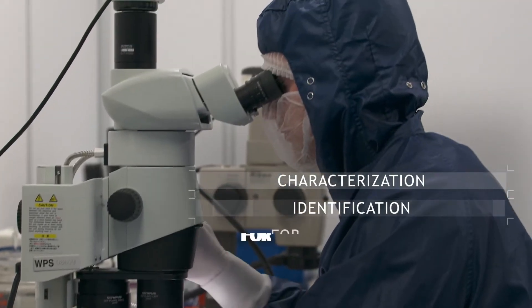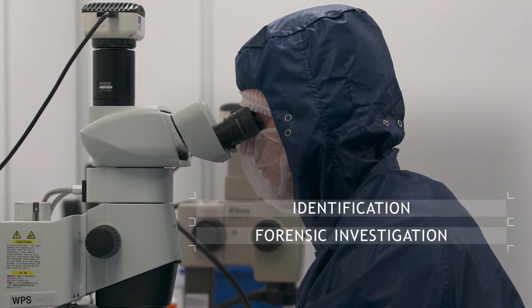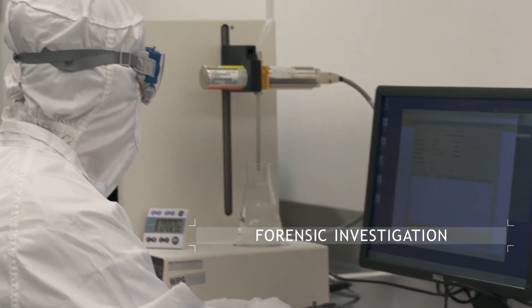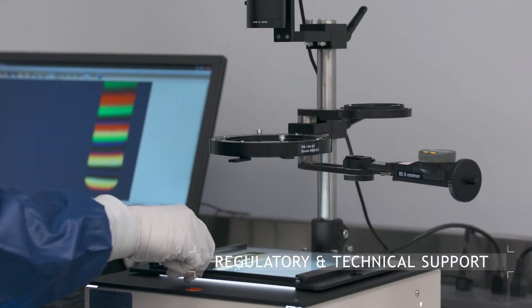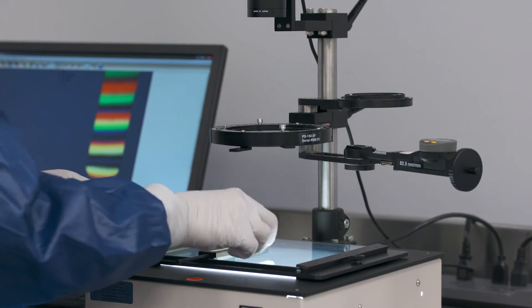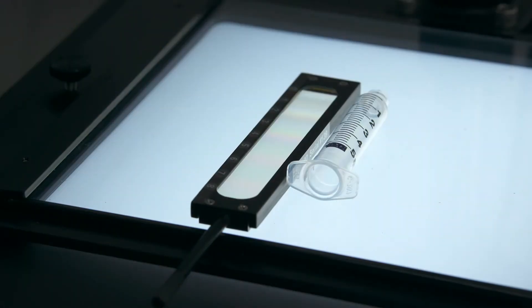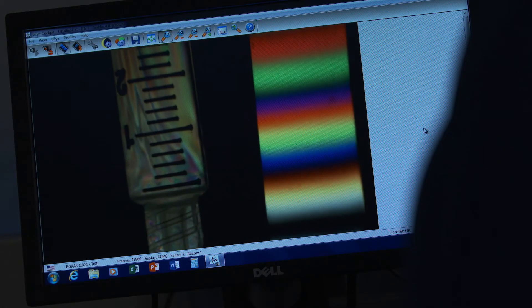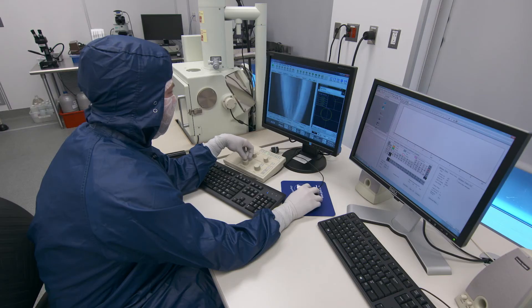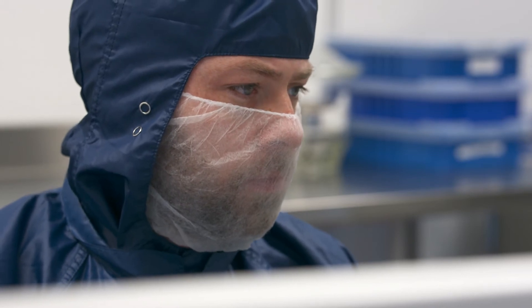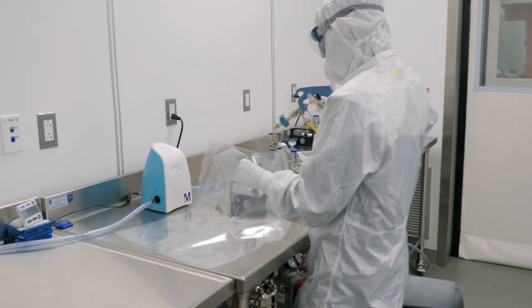We provide integrated analytical services such as particle counting, sizing, characterization, identification, and forensic investigation. In addition, the lab team will work with other resources as needed to provide comprehensive technical services and analytical support. This provides more support for drug product development to ensure that the particle load coming from newly developed product is understood, characterized and mitigated where possible, helping you to provide drug products that are safe and effective when they reach the market.